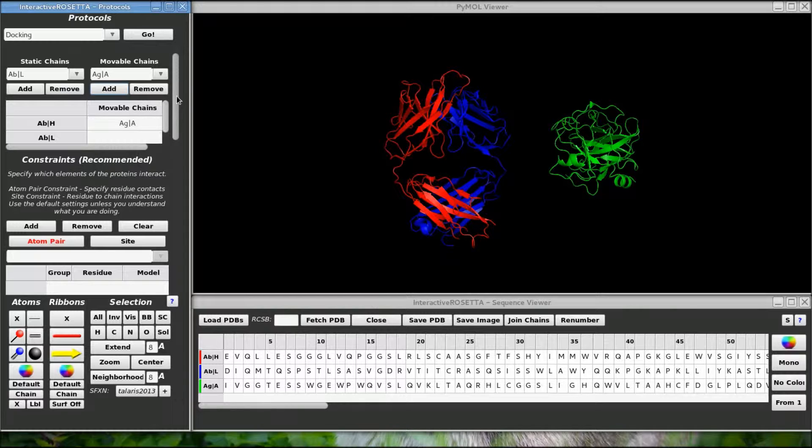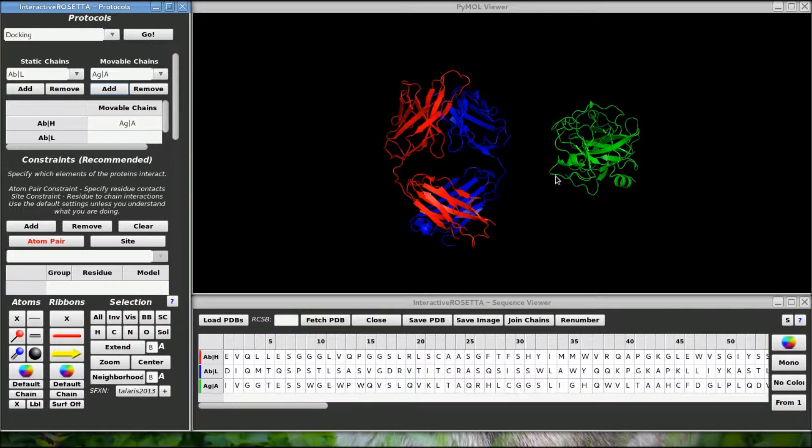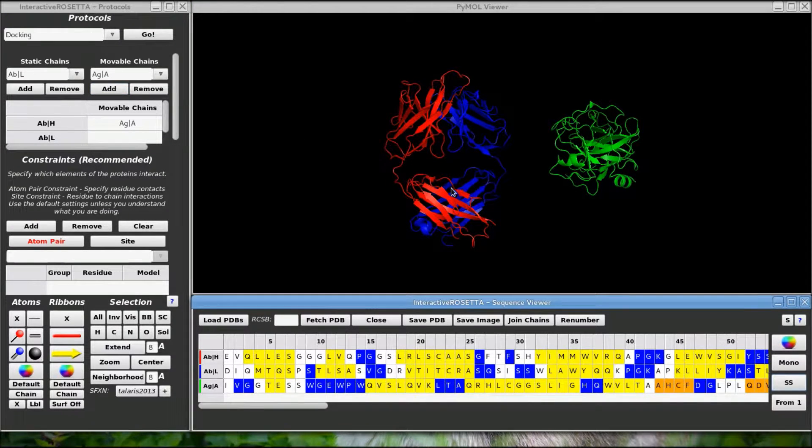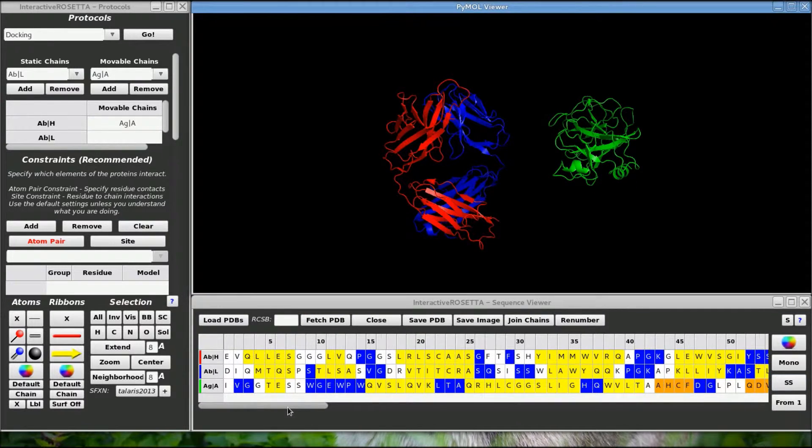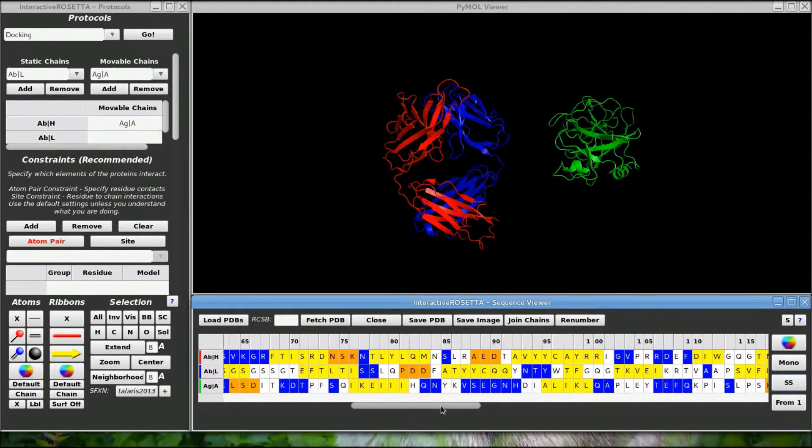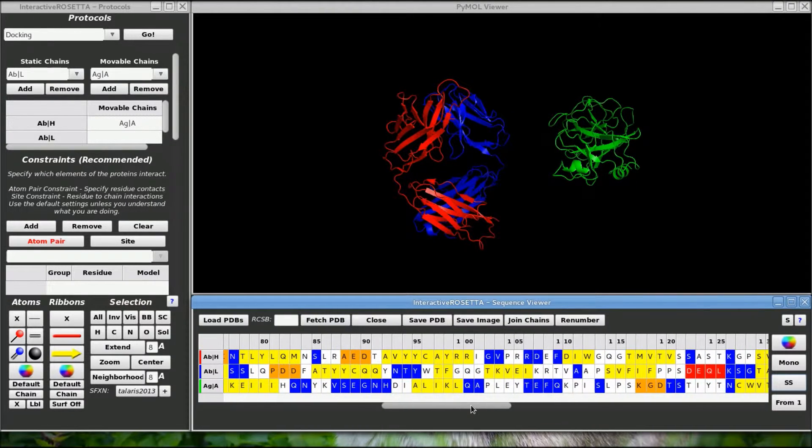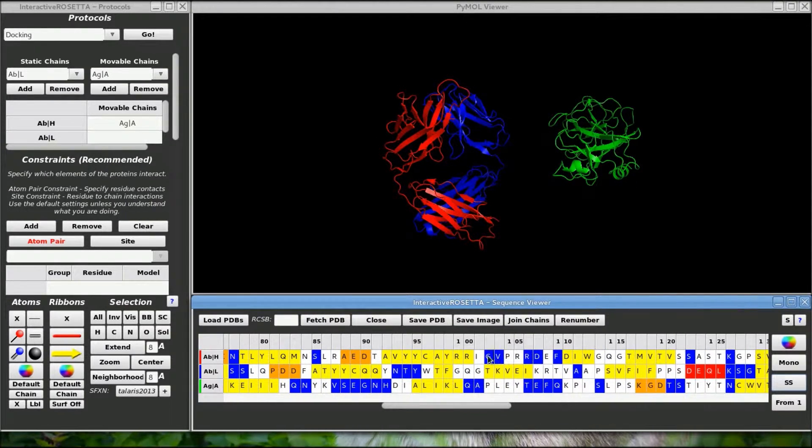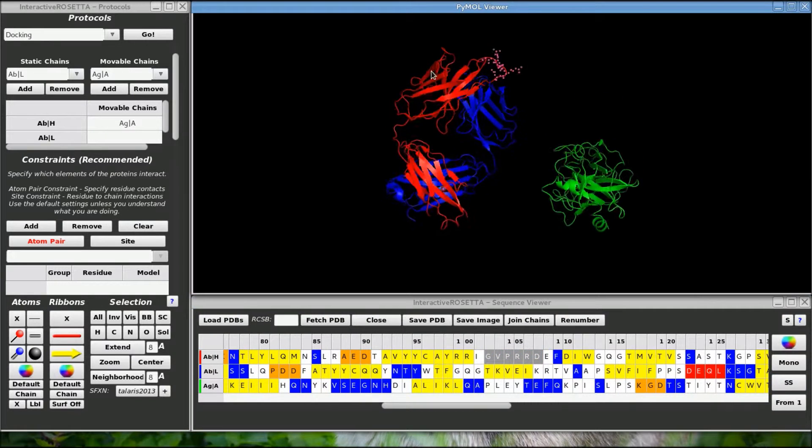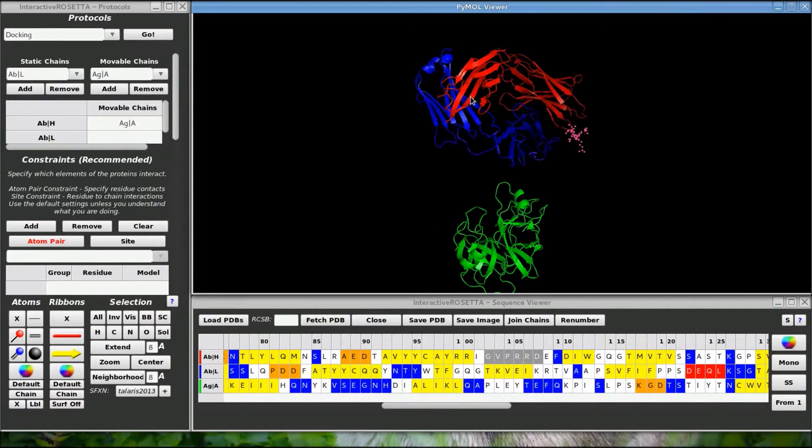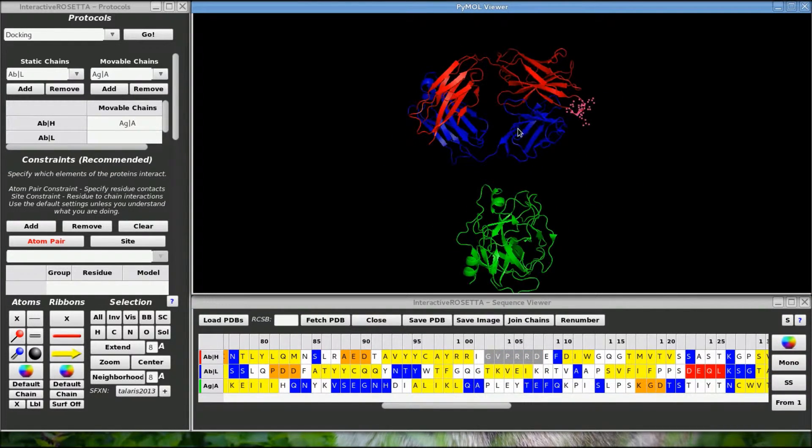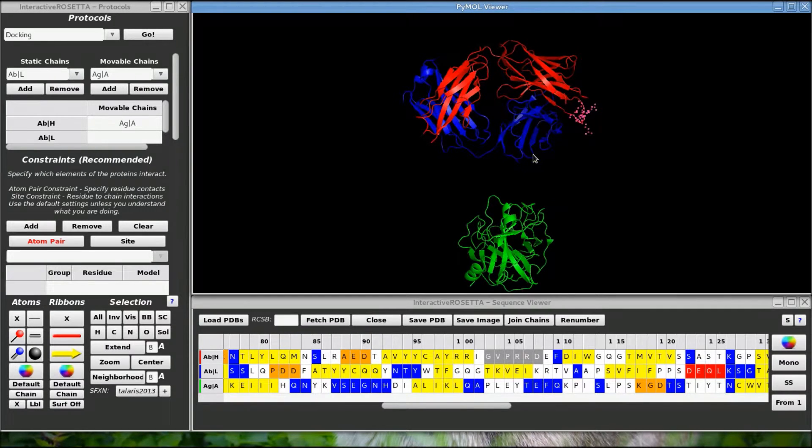Before we do anything else, let me show you something neat that can help Rosetta out a bit. Since this is an antibody docking exercise, I know that the CDR loops are going to be facing the antigen, so there is no need to randomize the orientation of the antibody, only the antigen.